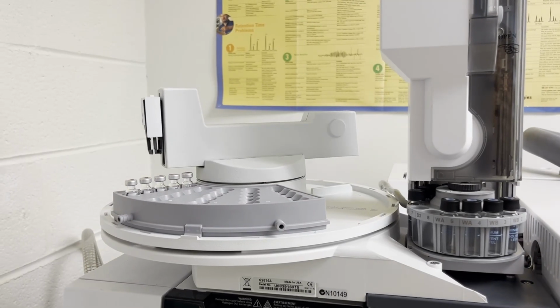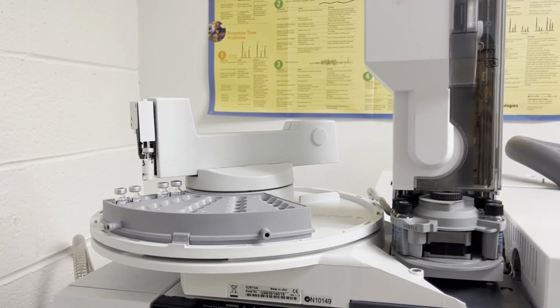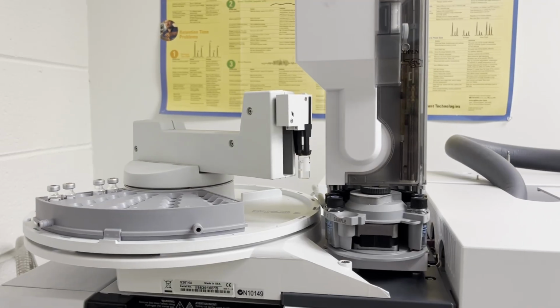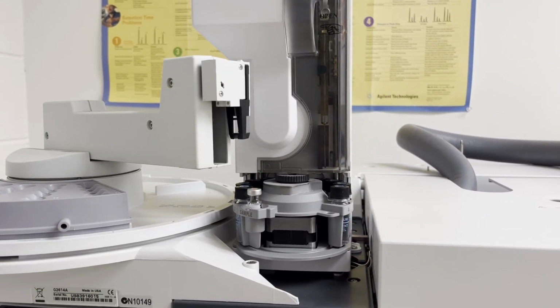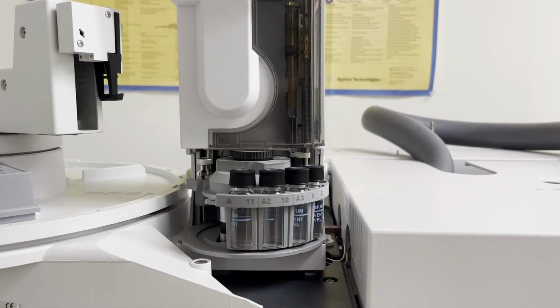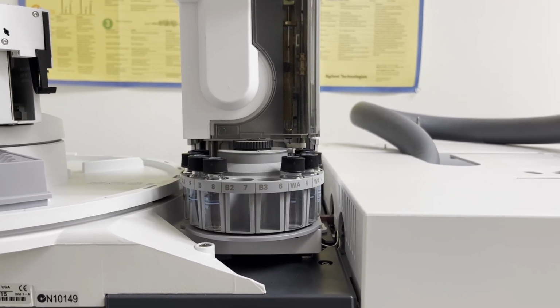The vials are placed in the tray and the autosampler arm automatically loads the selected sample. Up to 100 vials can be added to the tray at a single time. The injection needle is washed to eliminate contamination from previous samples. Then the selected sample is injected onto the column.